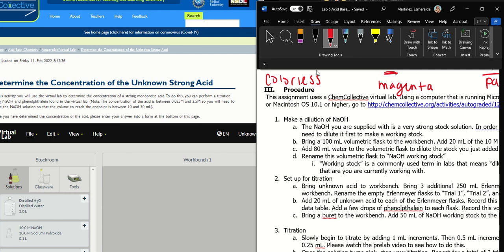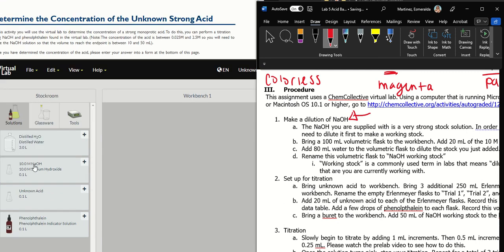I always try to split up the procedure into the themes. So first major task you are completing is you're going to make a dilution of NaOH. So the NaOH that you are given here in the virtual lab is 10 molar. That is very strong. Like, really strong. So what you need to do is make a dilution of it. And that is what we are going to term or name our working stock because that's what we're working with. This right here is the stock solution versus NaOH, the dilution that we make, is our working solution. So you can call it working solution, working stock, whatever it is that you want to call it. That's just a common term in lab that you use. So you're going to make that first. And here I described to you how you do that. I tell you all the volumes and everything. It's just a matter of you doing it.